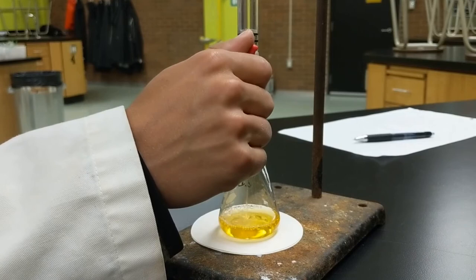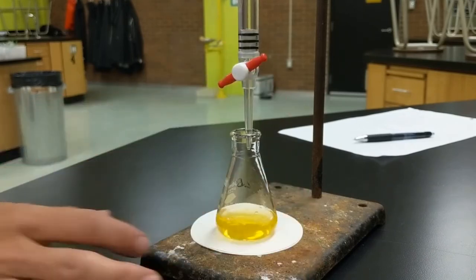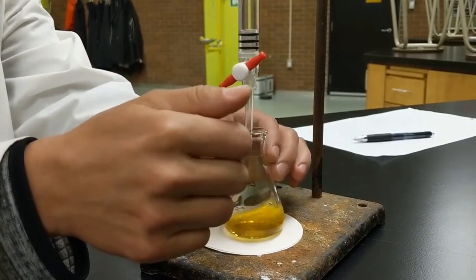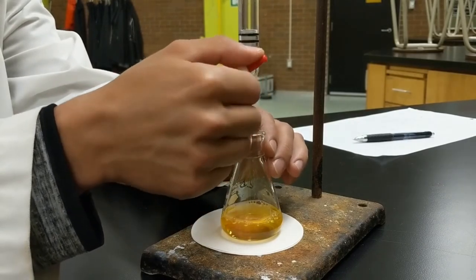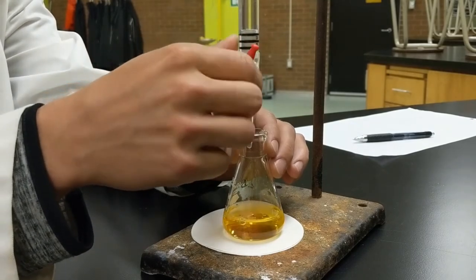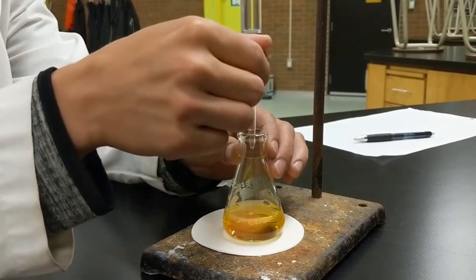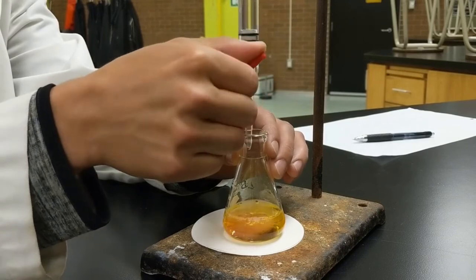Here we go with our first trial. When I first start I'm letting quite a bit of the titrant out — that's okay because I know roughly how much volume I'll need. From doing this in the past, my guess is about 15 milliliters, maybe a little less. So here I'm going fast to begin with — and foreshadowing, that's not the best idea.